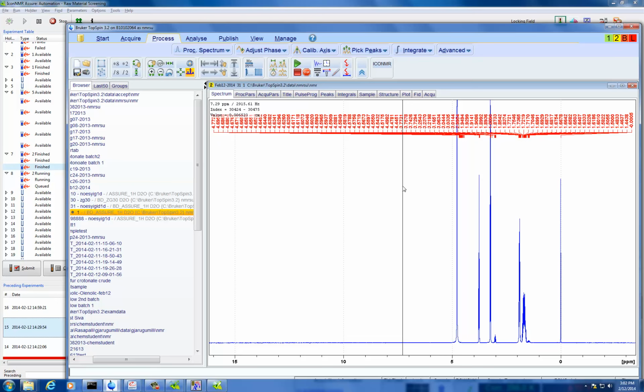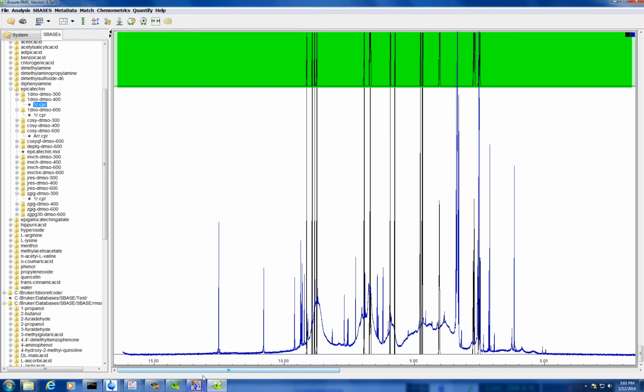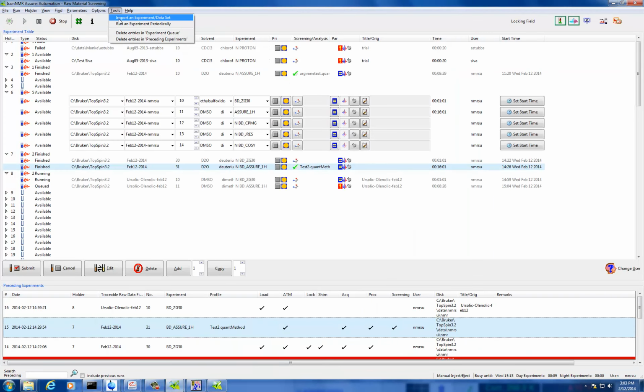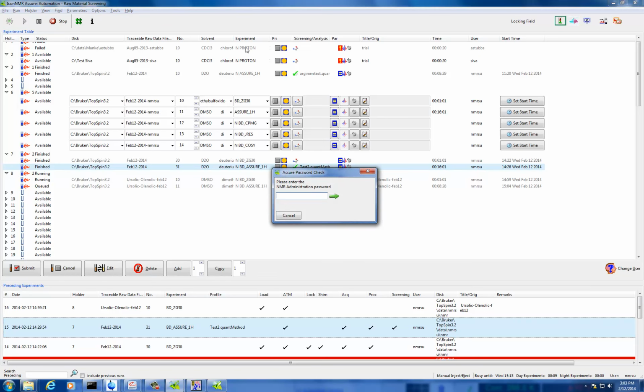So next I'll be telling you how to do the quantification standard run. I'm going to teach you guys that, which is very simple. You have the same method, you create it the same way, and all you're going to do is say this is a calibration standard. That's the only difference. When you run the method, for example your arginine method that you made, to run it as a quantification standard, you go to configuration.